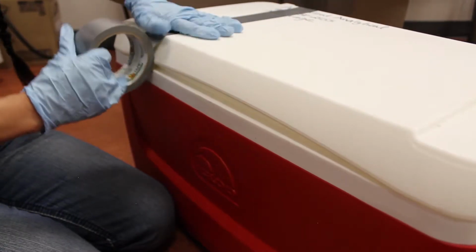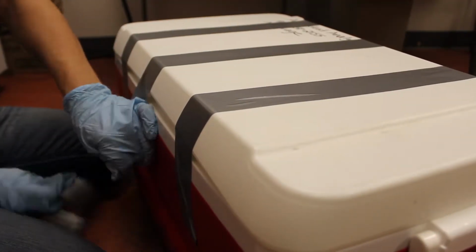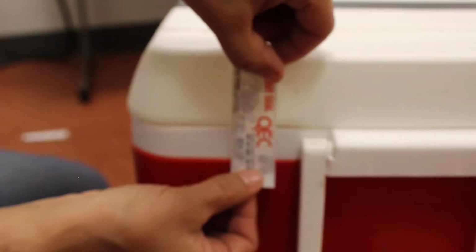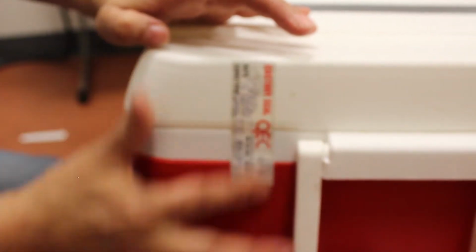When everything is in the cooler, secure with duct tape so it doesn't open during shipment. Place the custody seal on the cooler's opening lip so the lab will know that there has been no tampering with the samples. Your samples are now ready to send to the lab for analysis.